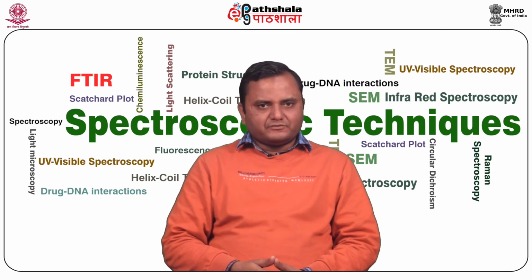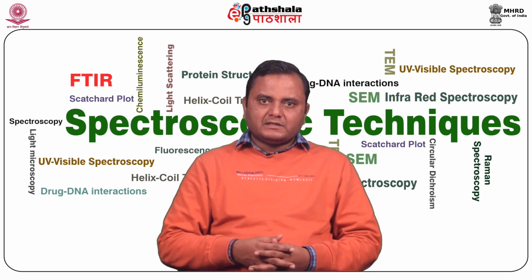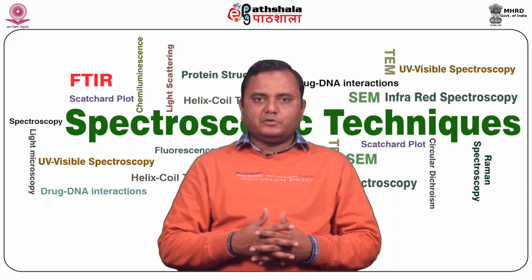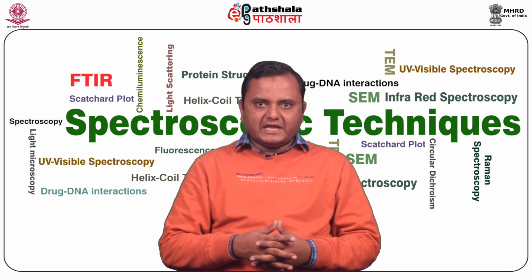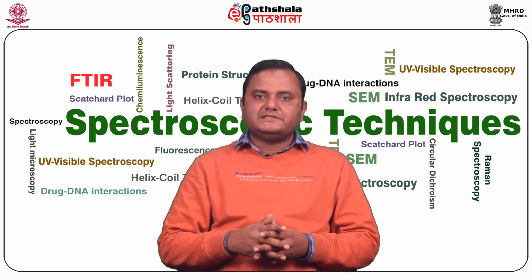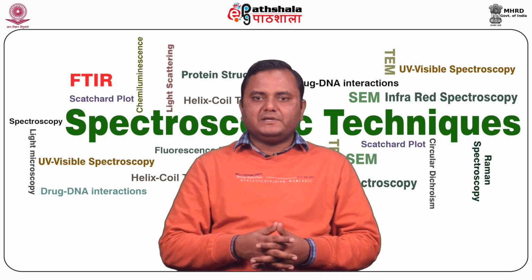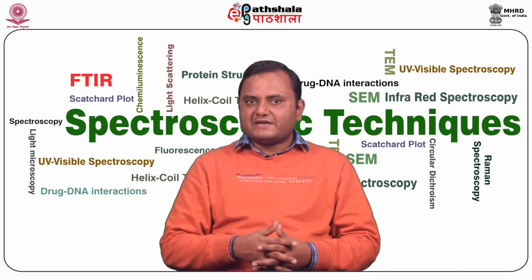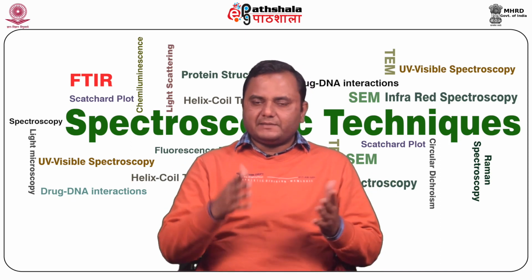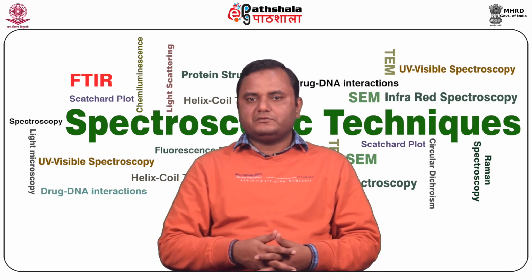In fluorescence there are several parameters, in which fluorescence lifetime is one of the major and important components of fluorescence spectroscopy. This is another property of a fluorescing molecule, that is the lifetime. It is represented by tau of the lowest excited singlet state. The lifetime of the excited state is defined as the average time molecules spend in the excited state prior to returning to the ground state. Generally, fluorescence lifetimes are near 10 nanoseconds. It is a very short lifetime, and that relates to the quantum yield of fluorescence and tau r. So the fluorescence lifetime is related to the quantum yield of the fluorescing molecule, and they have a particular relationship, described as the quantum yield phi equals kf divided by kf plus kd, which equals kf into tau.